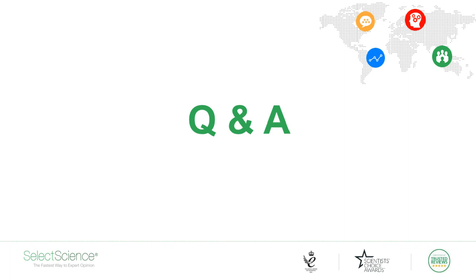Great, thank you, Sven. We've just got time for one more question. What is the difference between the small molecule binding MALDI approach published by Genentech and what you can do with the SPR?